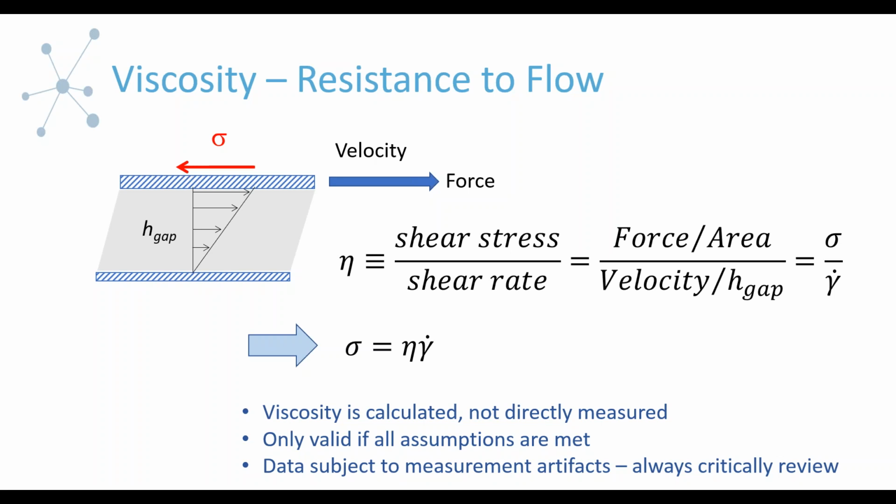So what that means is that the calculation is only going to be truly valid if all of the assumptions of the calculations are met. And that also then leads to the fact that viscosity data can be heavily influenced by measurement artifacts. So it's always important to critically review your data and assess whether or not things are going as you expect them to.